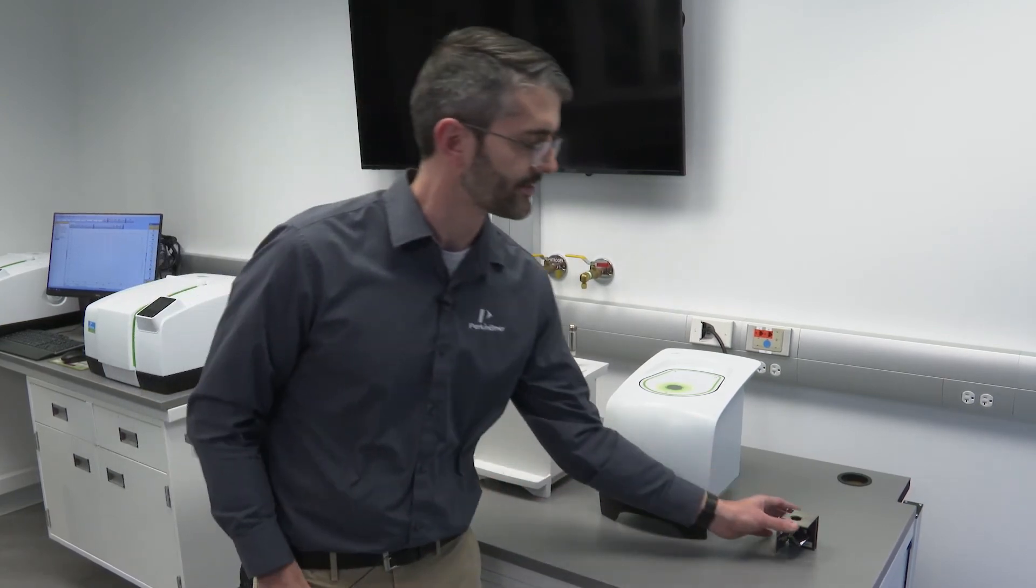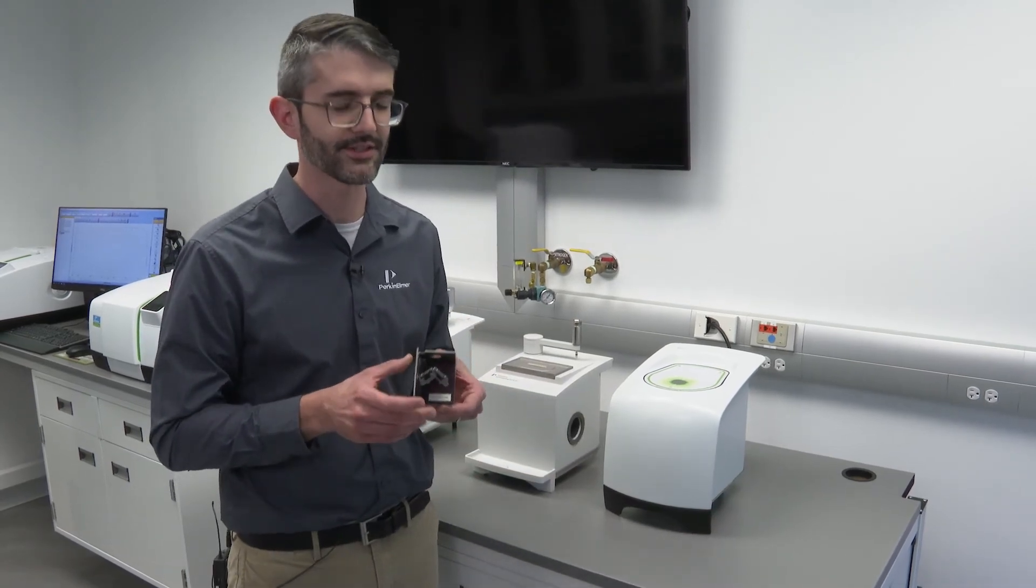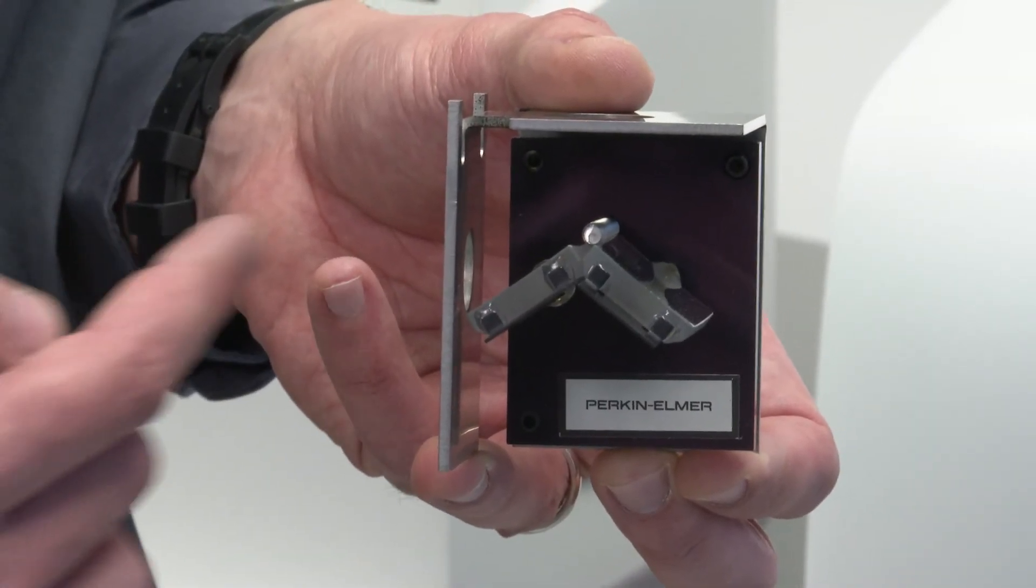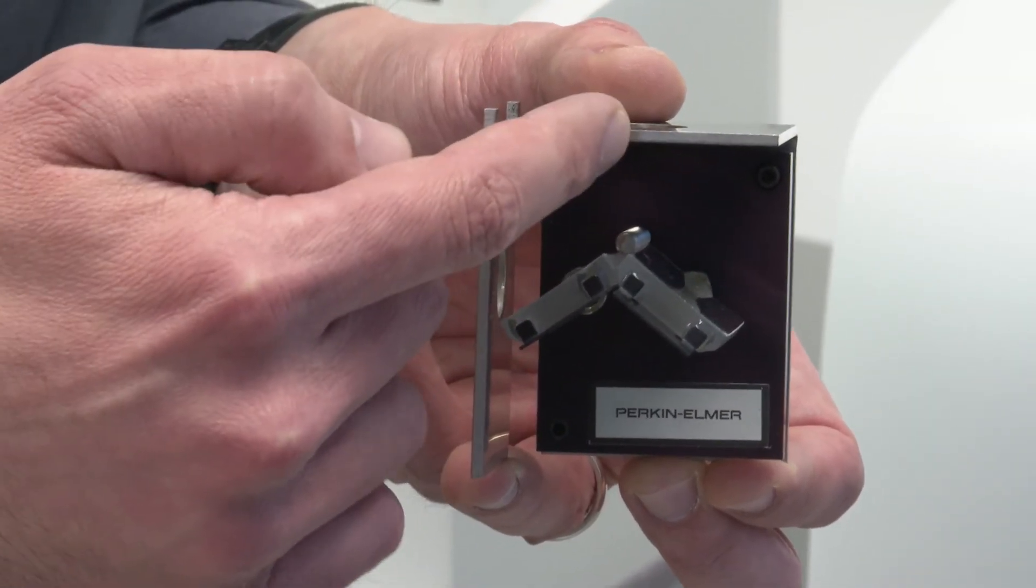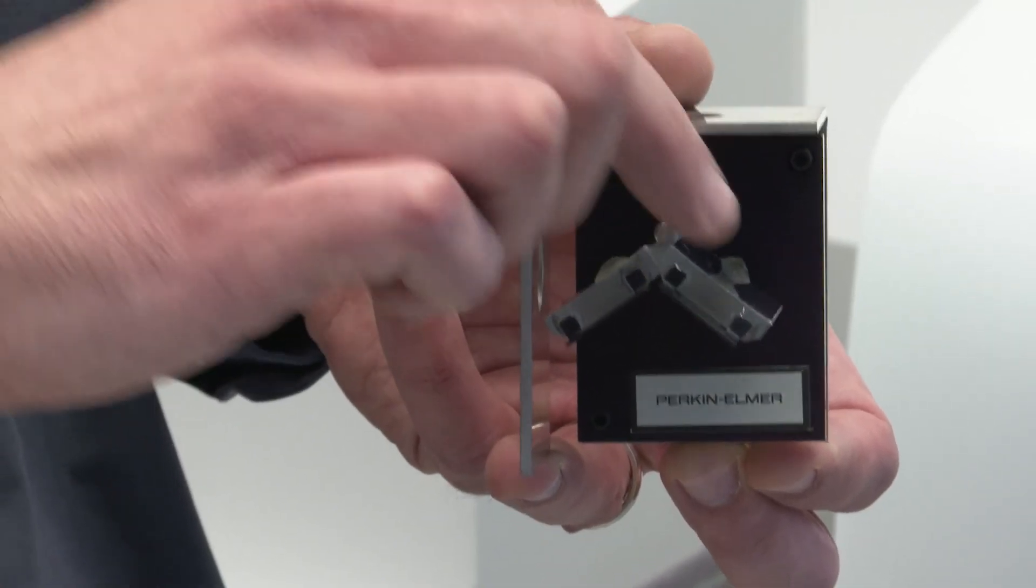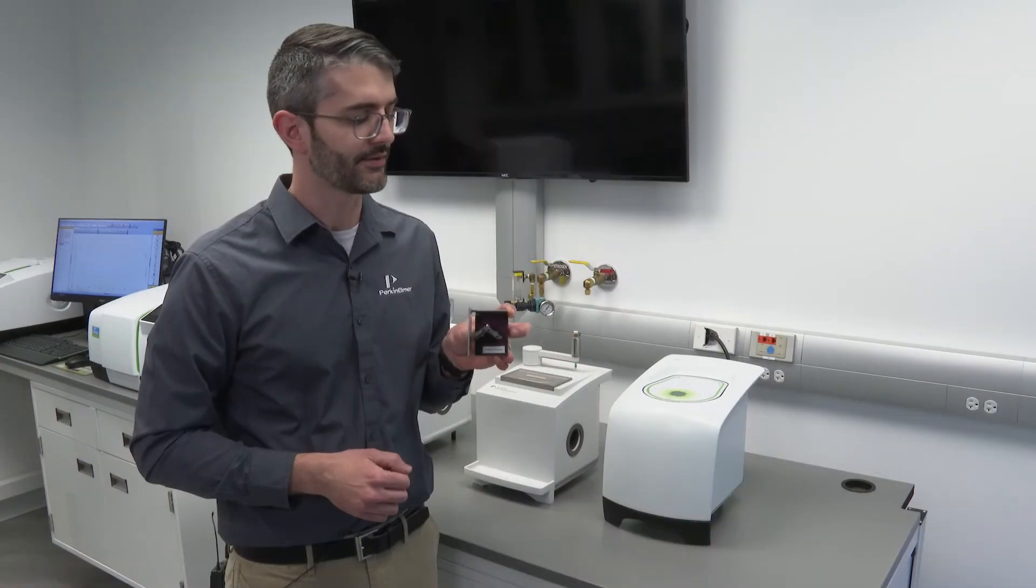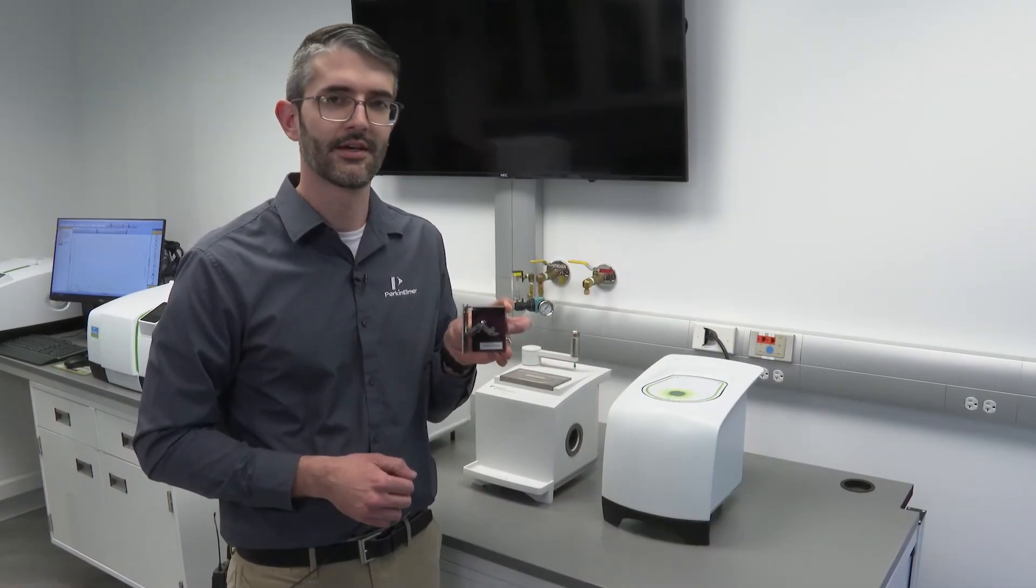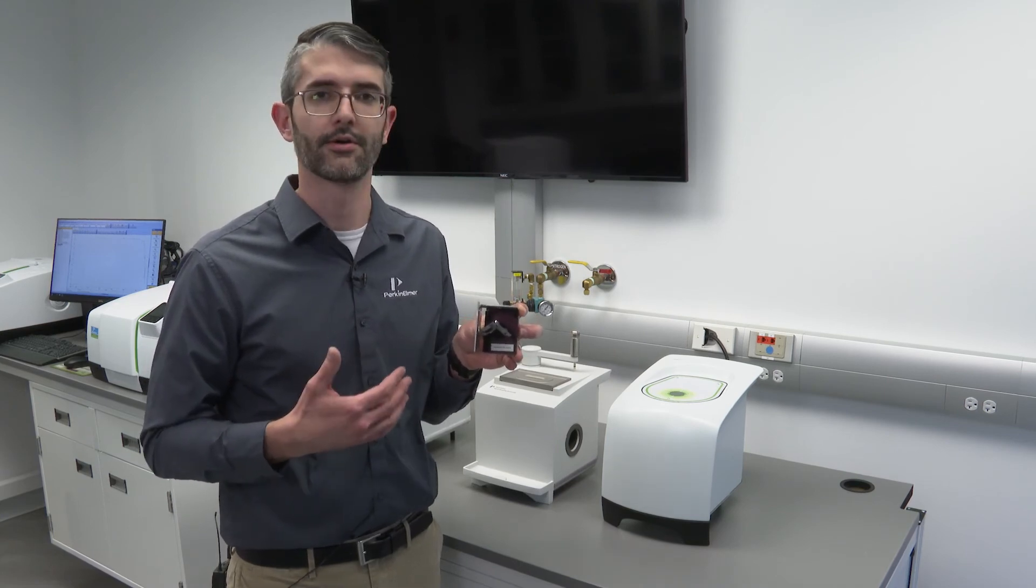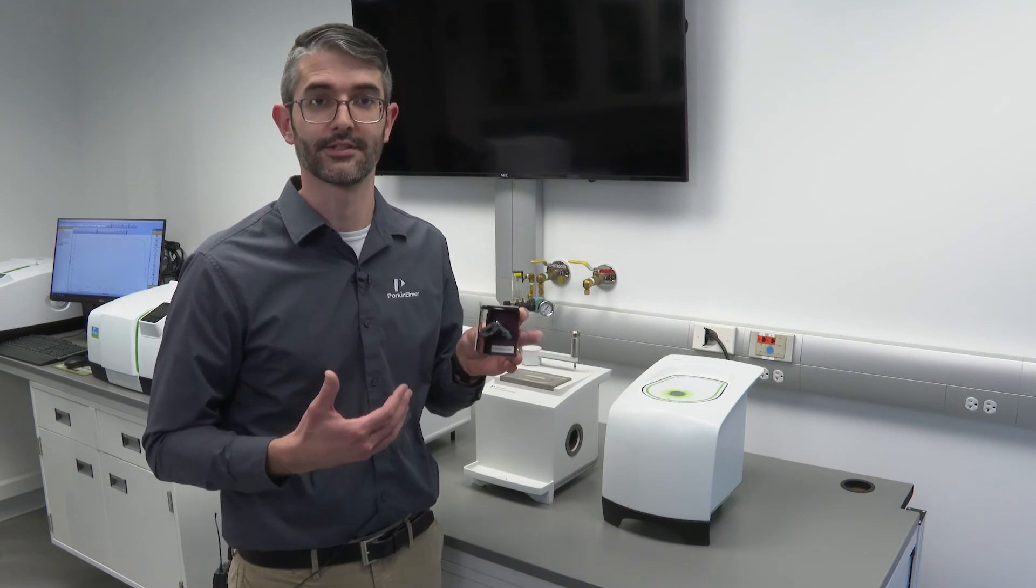Last but not least, another common approach which is employed with FTIR analysis is specular reflectance. With the specular reflectance accessory, the infrared light comes in, is reflected to the sample, the sample is positioned up top, and the infrared light is reflected to the detector. This is oftentimes used to measure reflectance of materials such as glass or coatings and coated materials, such as paints or other optical coatings as well.